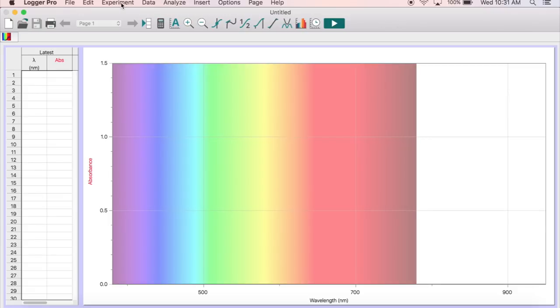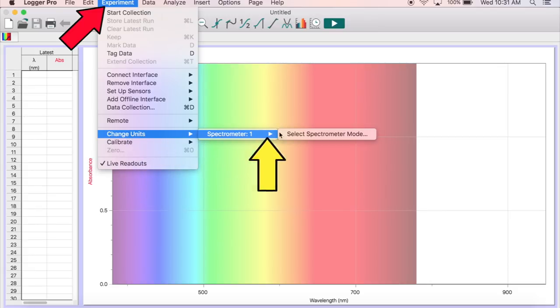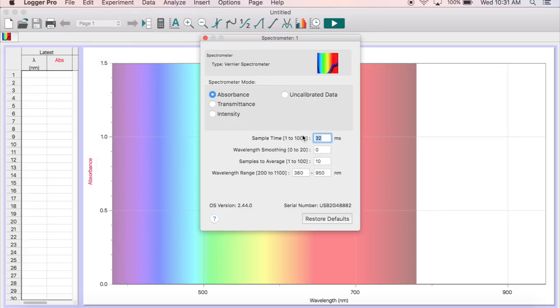The default setting on LoggerPro is Absorbance vs Wavelength. This needs to be changed to Intensity vs Wavelength. To do this, click on the Experiments tab at the top of the page, and from the drop-down menu select Change Units, Spectrometer 1, and then pick Intensity.